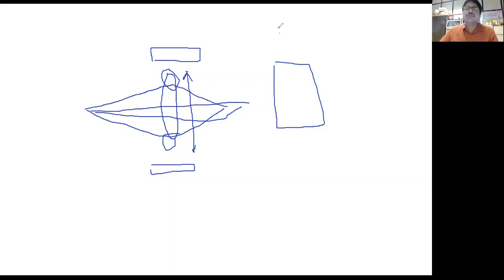The objective of a microscope is that suppose you have one point here, another point here. This is the objective plane. And finally, you would like to get a point here. But because of this problem, because lenses are not perfect, this point becomes a disc actually. So the radius of the disc.